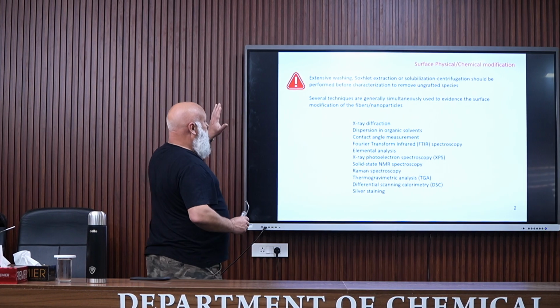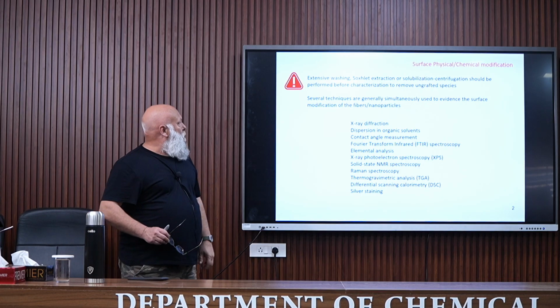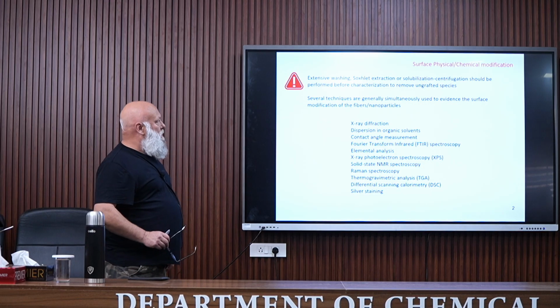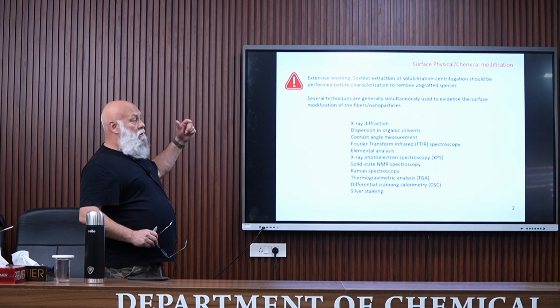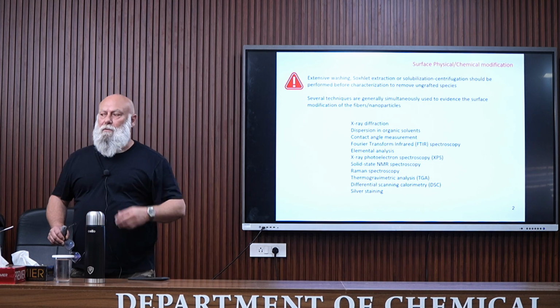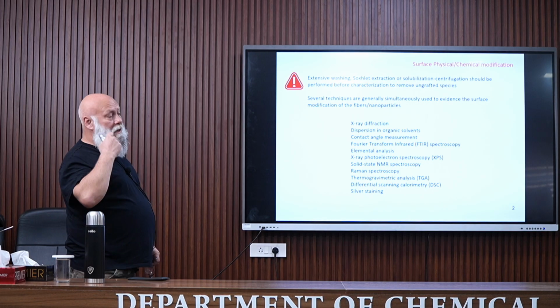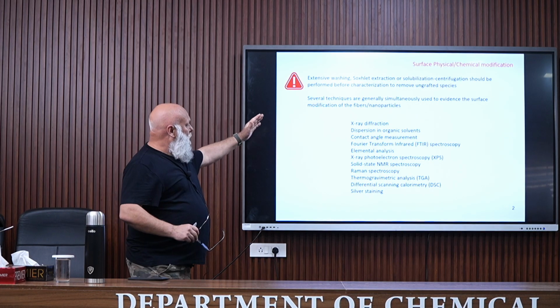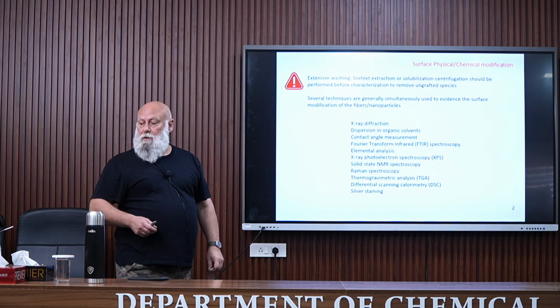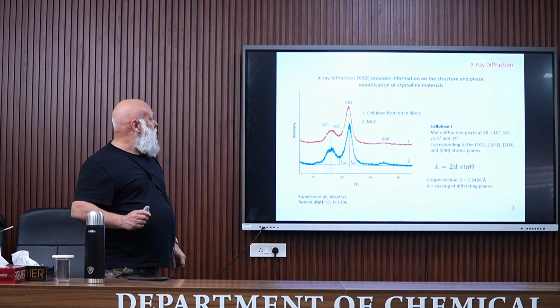So first, an important note. It's necessary to perform an extensive washing, extraction, and also solubilization, centrifugation. It should be performed before characterization, and the objective is to remove ungrafted species. So there are different techniques that can be used. I will present only these techniques, but some other techniques can also be used.